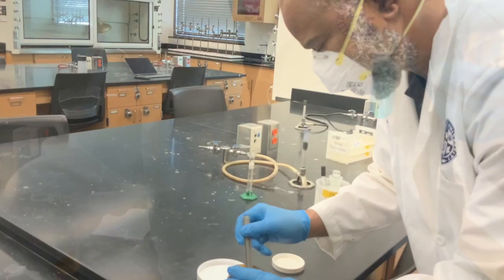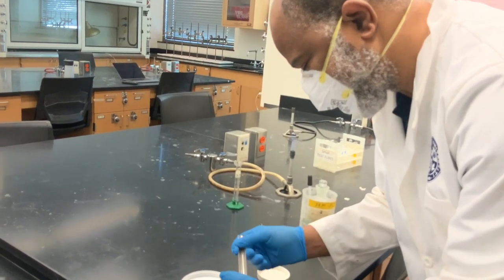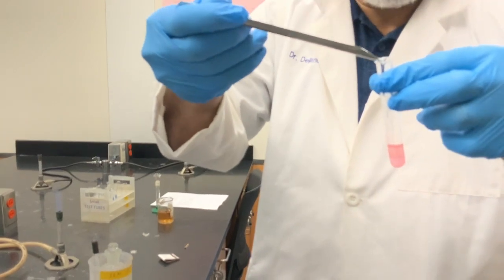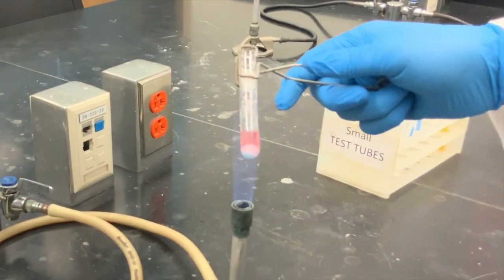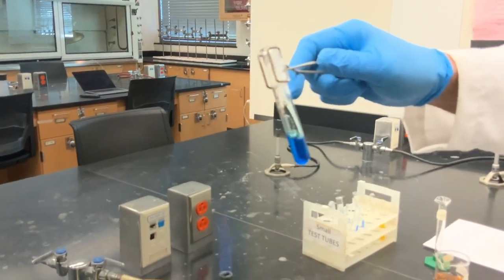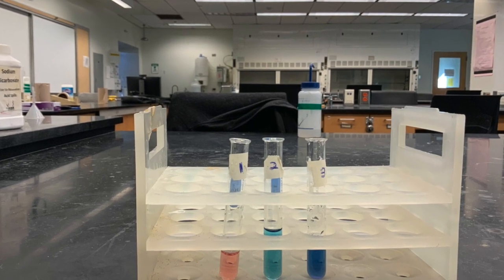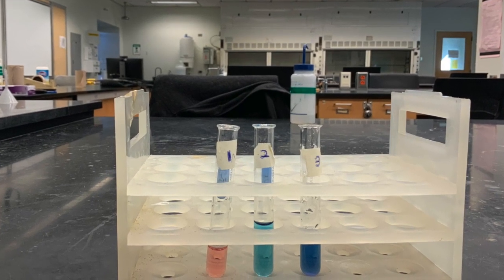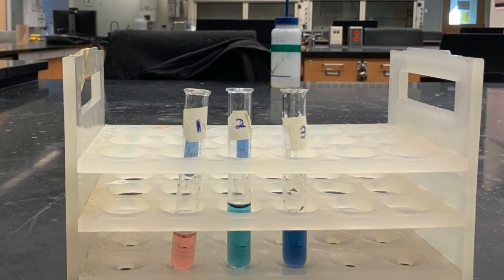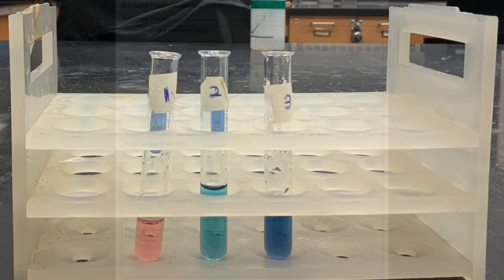To the third sample of cobalt chloride, we first add solid ammonium chloride. Note the solid at the bottom, which means the solution is now saturated with ammonium chloride. We then heat the solution over a Bunsen burner. Record what you observe in your lab report. These are the 3 test tubes. On the left is the control sample. In the middle is the sample mixed with 12 molar HCl. And on the right is the sample mixed with ammonium chloride and heated.